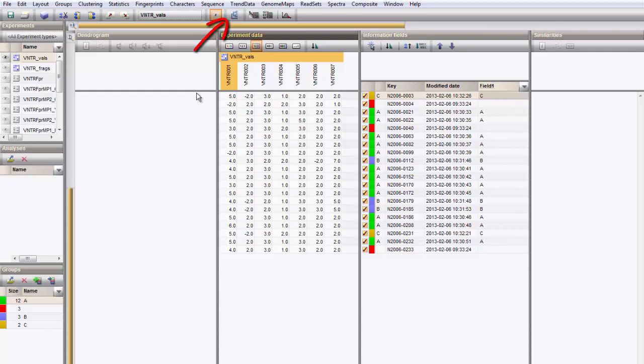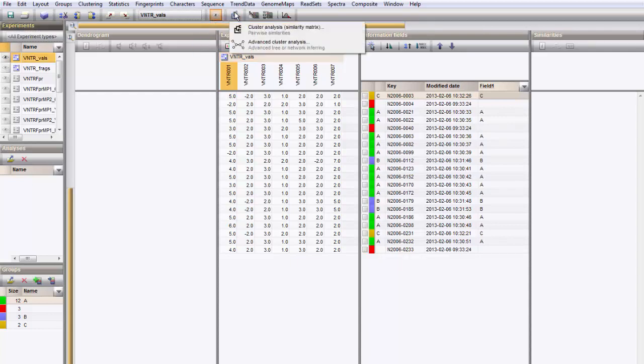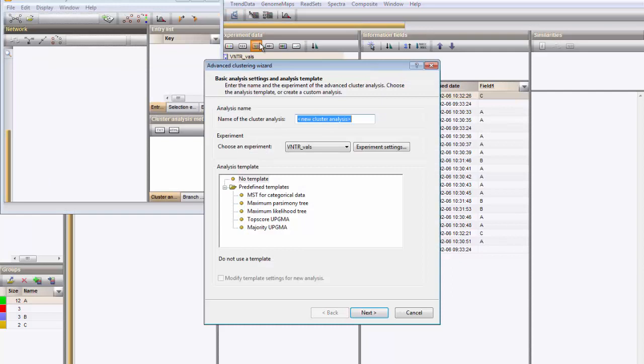Press the clustering button and choose Advanced cluster analysis. Give the analysis a name.